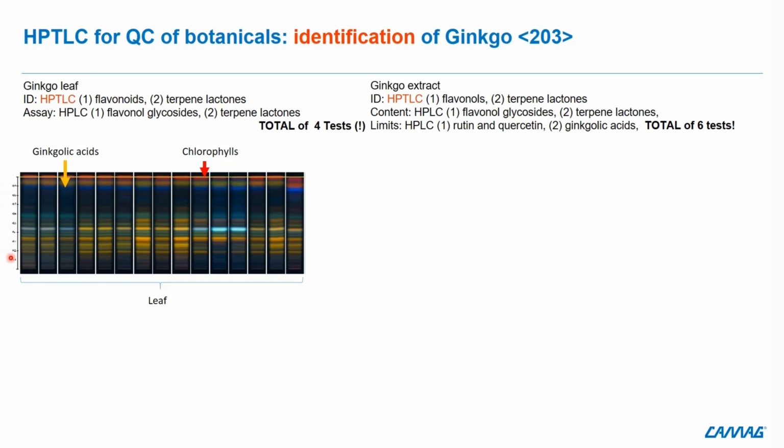The fingerprints can be compared side by side, and the pattern of each sample will show whether the characteristic zones for Ginkgo are present. Those are the fingerprints obtained with the Ginkgo method for flavonoids. After development, a derivatization with natural product reagent is performed, and an image of the plate is captured in long-wave UV light for fluorescence detection.